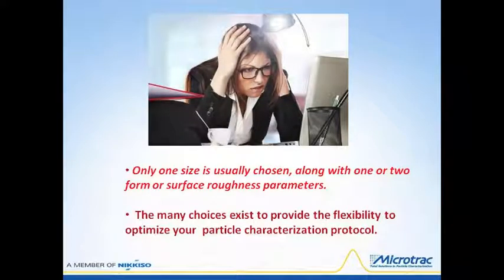Just to let you relax a minute, don't be overwhelmed by the number of choices that you have here. You'll end up using very few, and they will depend on the application and specific problem that needs to be solved, and our support group at Microtrac is always there to assist. Only one size is usually chosen along with 1 or 2 form or surface roughness parameters. These many choices exist to provide the flexibility you need to optimize your particle characterization protocol.